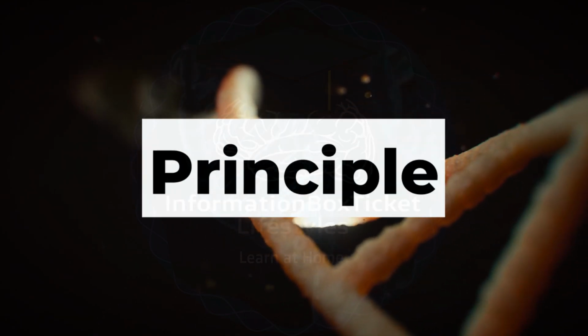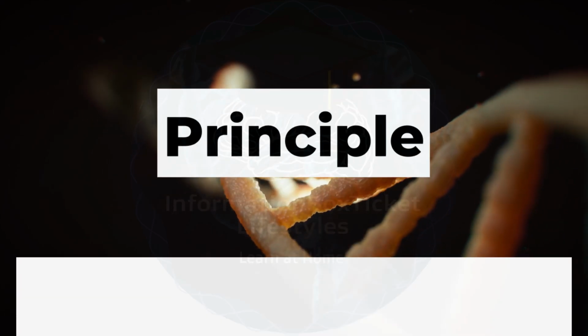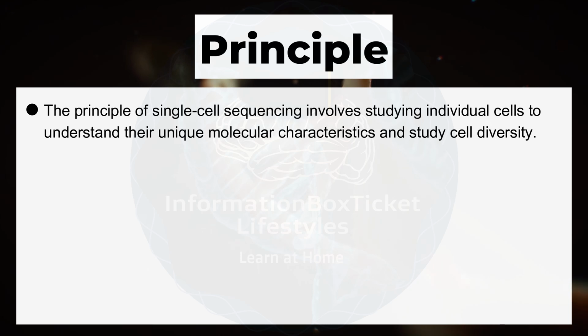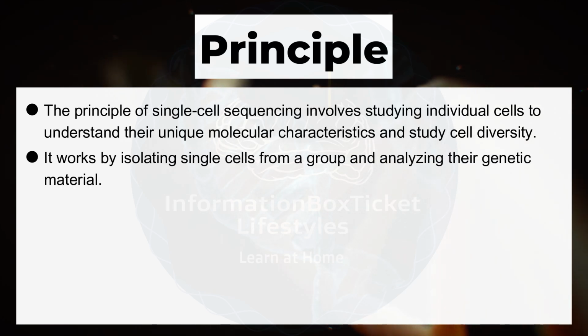Principle of single-cell sequencing. The principle of single-cell sequencing involves studying individual cells to understand their unique molecular characteristics and study cell diversity. It works by isolating single cells from a group and analyzing their genetic material.